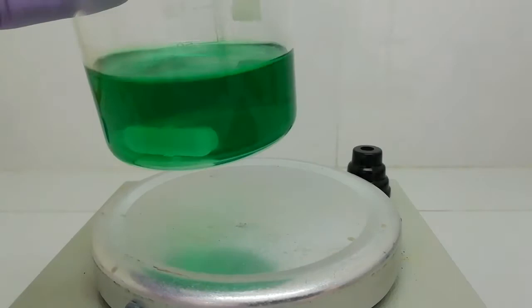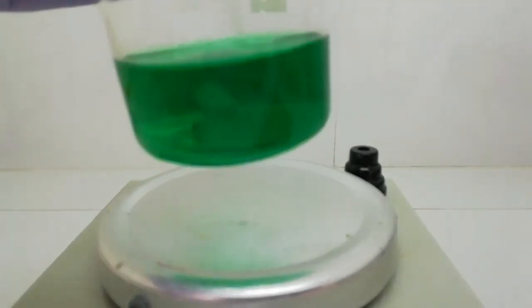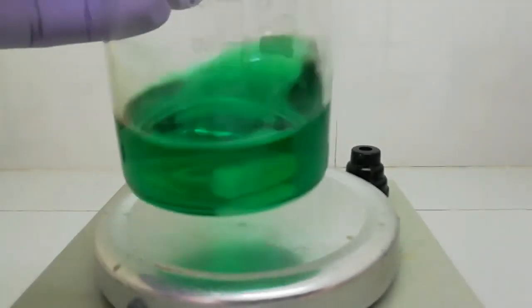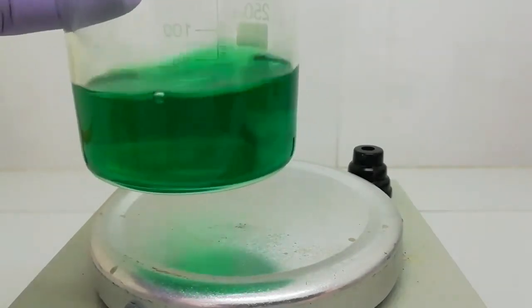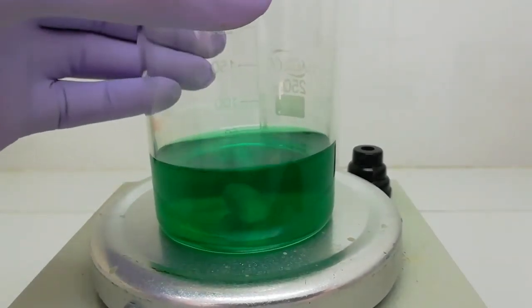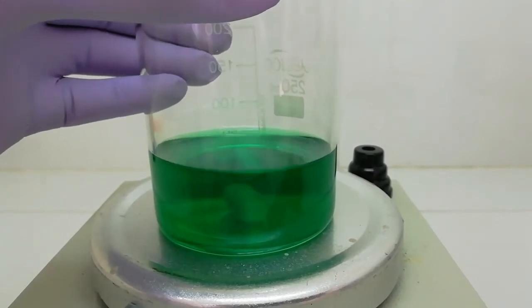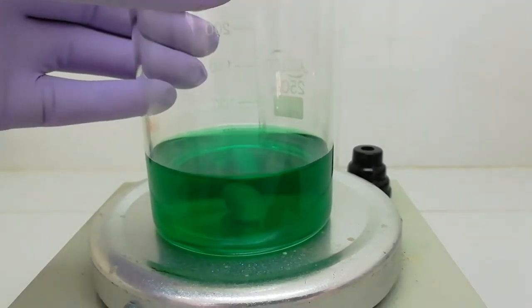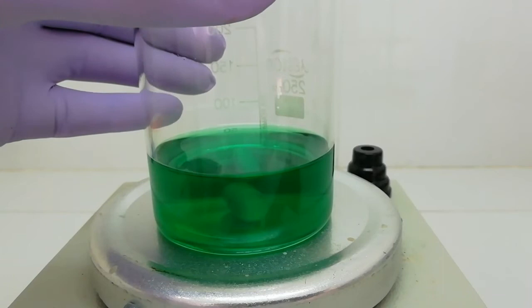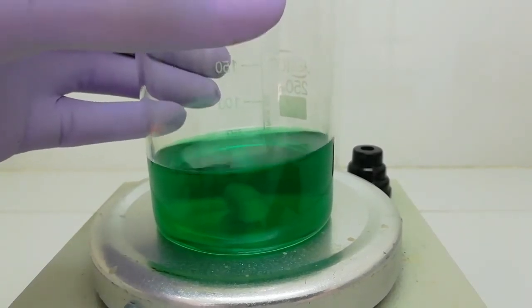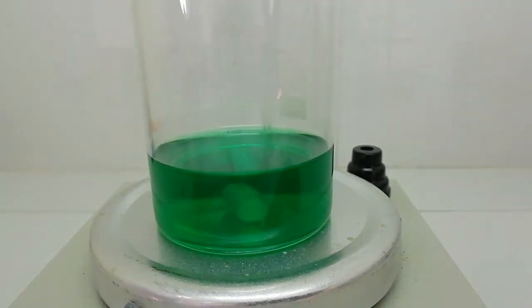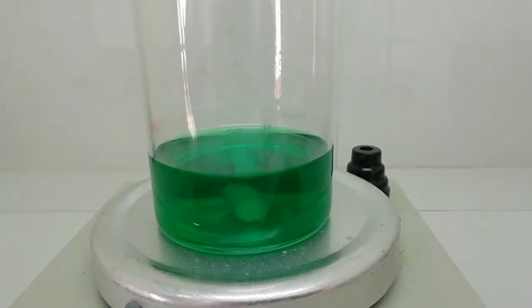After the filtration, this is the nickel chloride solution. This solution contains an extra amount of hydrochloric acid, so we need to evaporate this hydrochloric acid as well as reduce the volume. Then we can get the nickel chloride crystals. So now I am going to heat this reaction and evaporate all hydrogen chloride gas in this solution and reduce the volume.